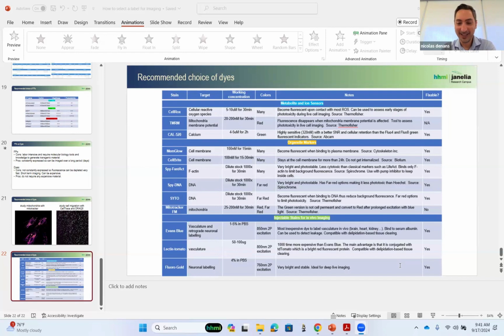I didn't even know that, and I work at Janelia. So yes, that's the kind of information that is critical. Most of these dyes can be sent as dry pellets, which is actually great. Most antibodies can be sent at room temperature too. People use -20 for no reason. That's actually fairly stable.